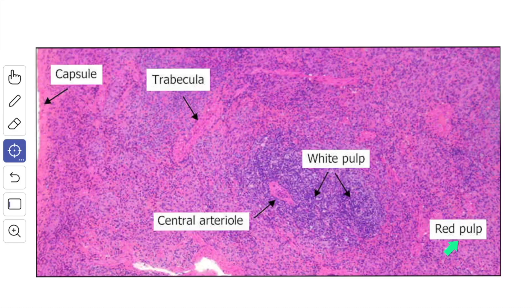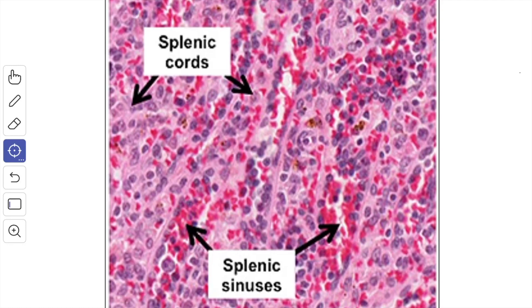The red pulp is a modified lymphoid tissue infiltrated with all the cells of circulating blood. It is like a sponge permeated by spaces called splenic sinusoids, which are lined by reticular cells. The intervals between the spaces are filled by B lymphocytes, T lymphocytes, macrophages, and blood cells. These cells appear arranged as cords called the splenic cords of Billroth, and the cords form a network. In the image showing red pulp, the splenic cords made up of T lymphocytes, B lymphocytes, macrophages, and blood cells are visible alongside the splenic sinuses.